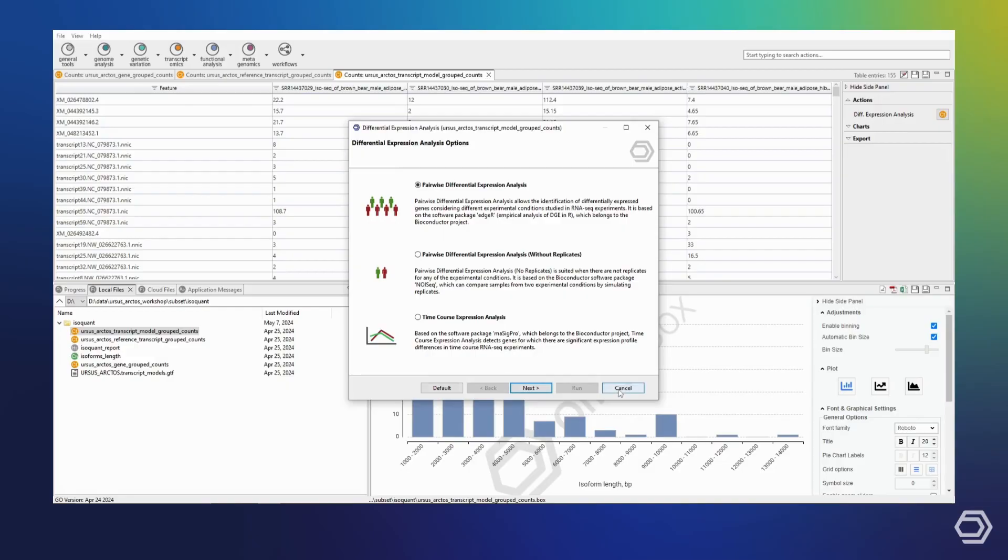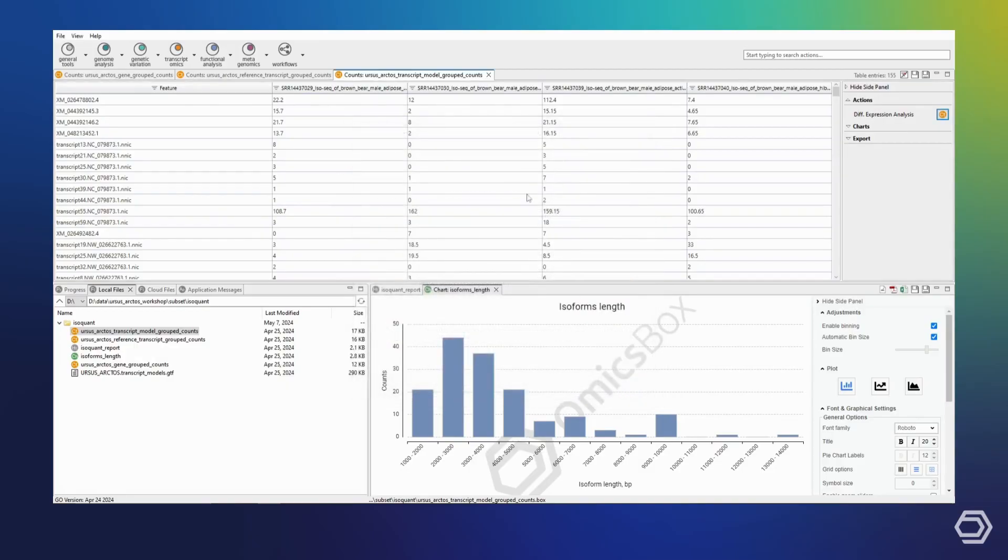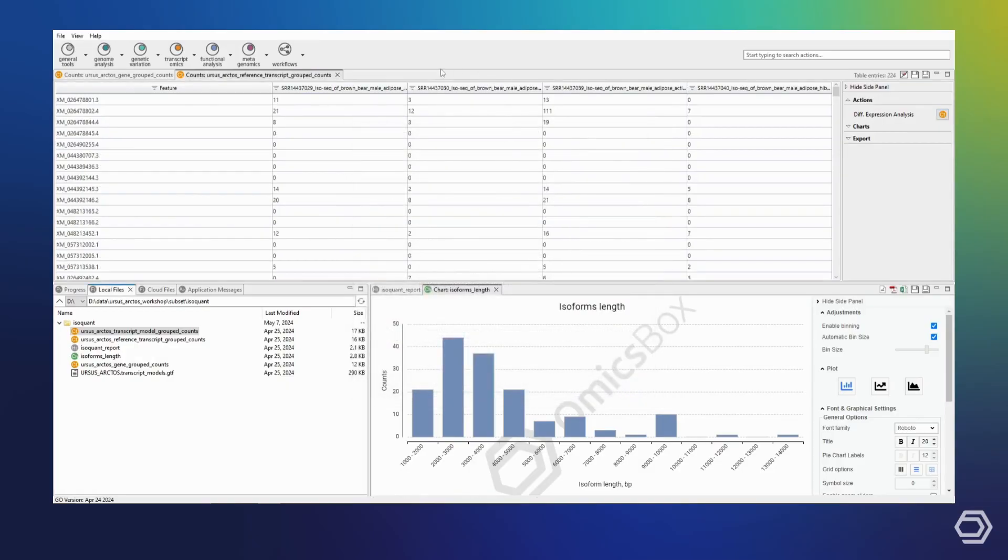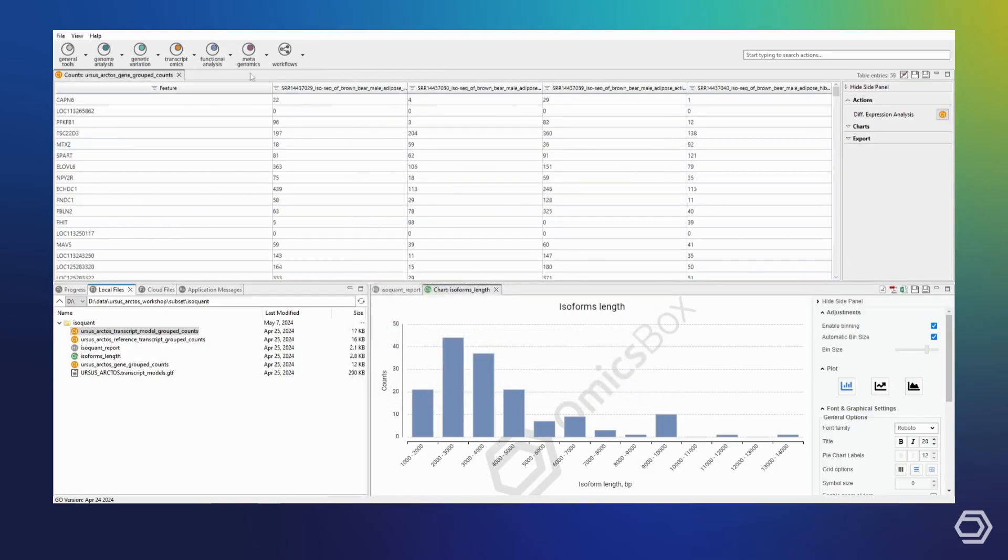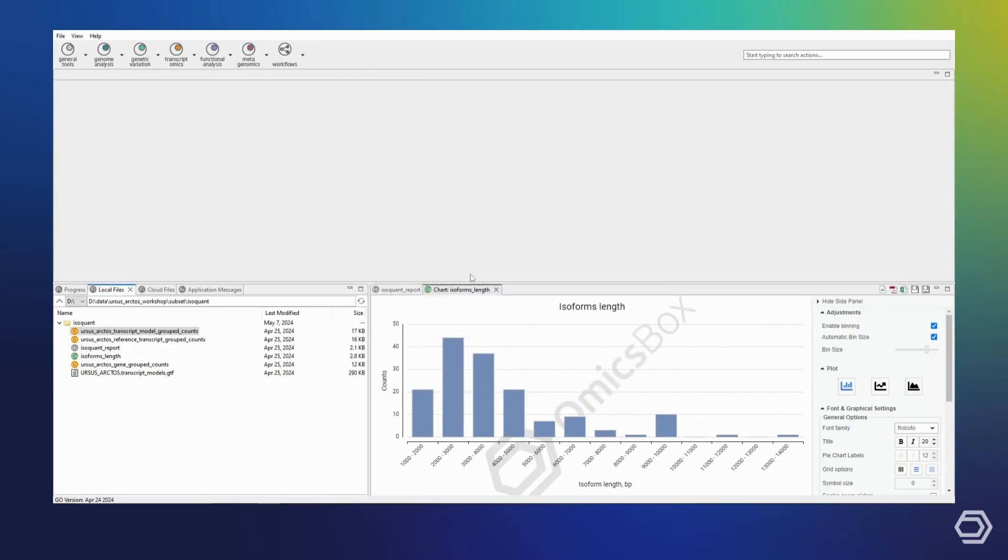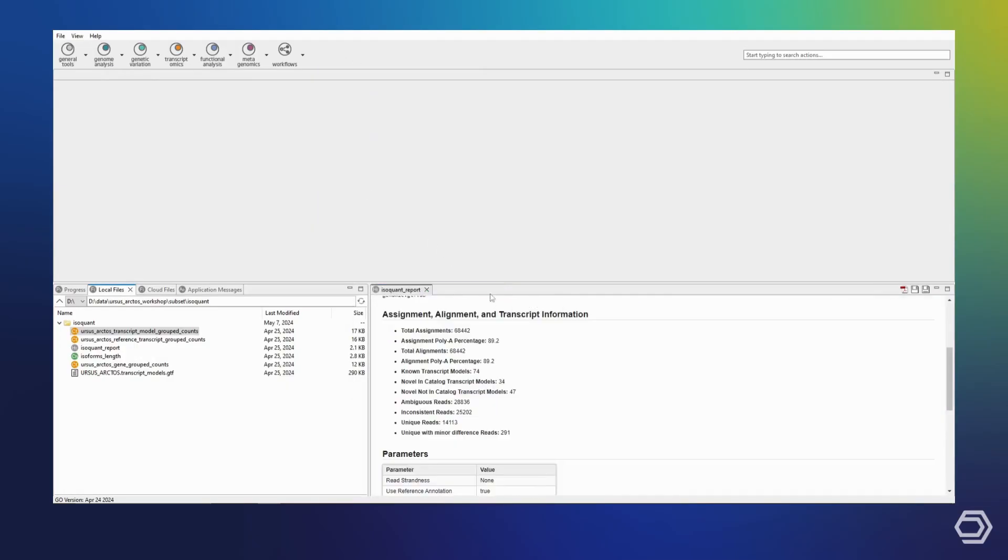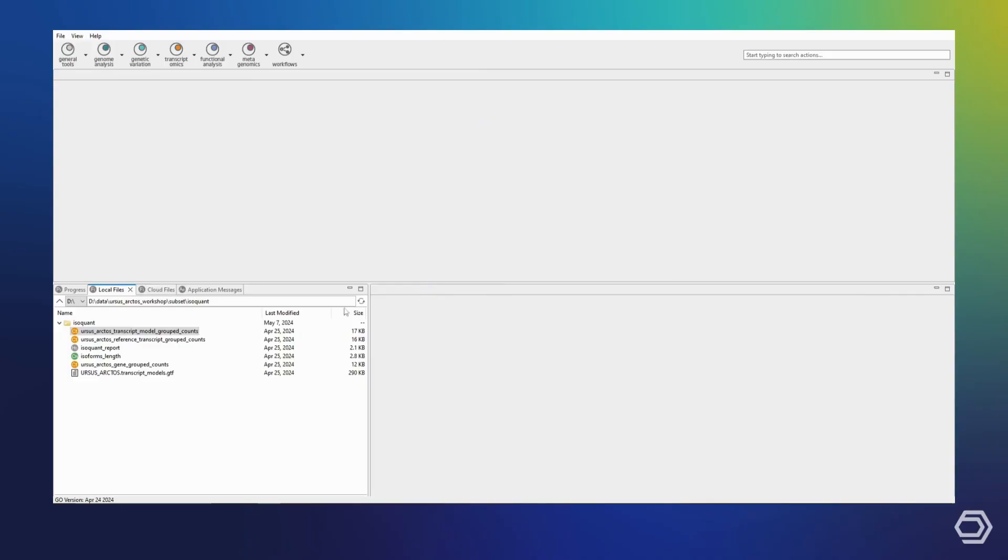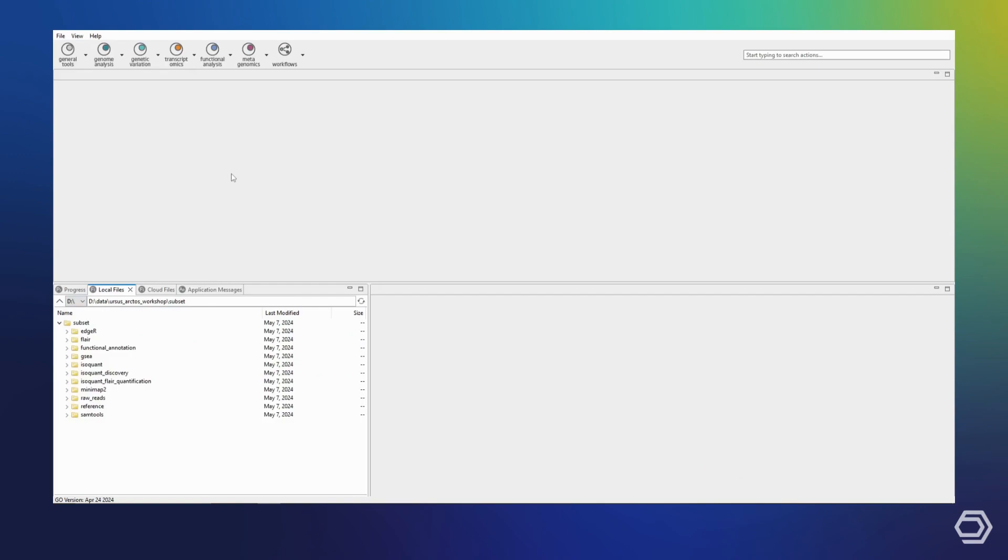After closing these results, we can run IsoQuant again for a different use case. Imagine that we may not have a good quality reference annotation for our species available. In this case, we can make use of IsoQuant's so-called discovery mode and run without a reference annotation.